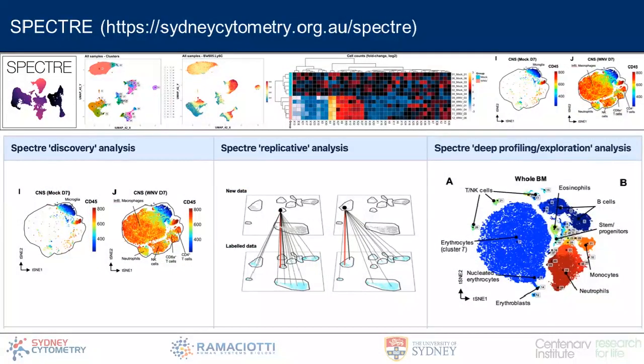In particular, we have a number of workflows that we integrate into our package here. And the main one that we use we just call our discovery workflow, which is essentially for analyzing samples where we don't exactly know what subsets we're trying to investigate. We don't exactly know what these might look like. And so it's an open platform for approaching novel data sets.